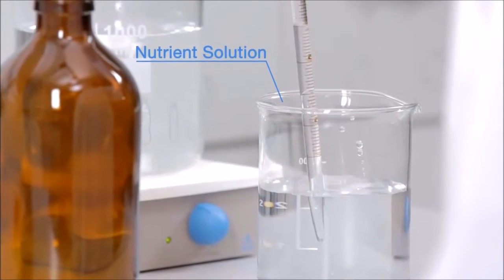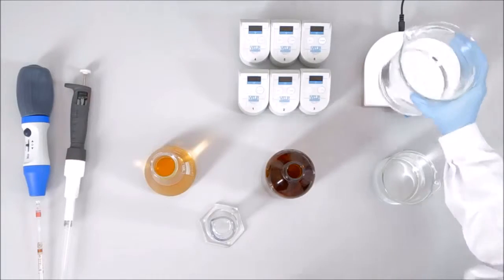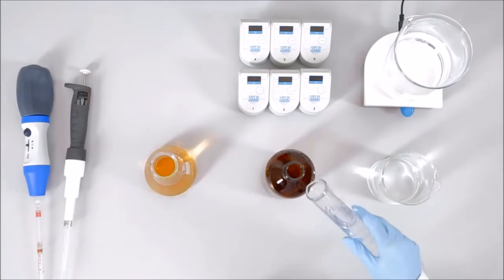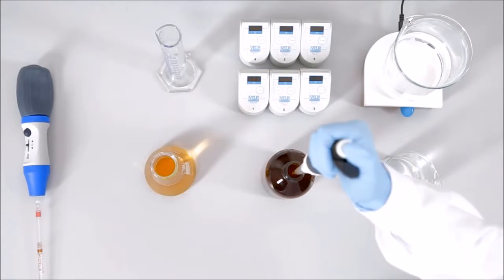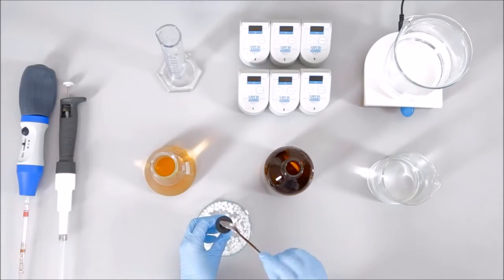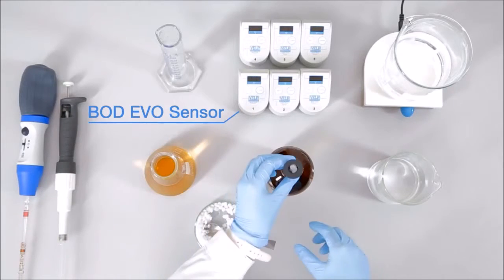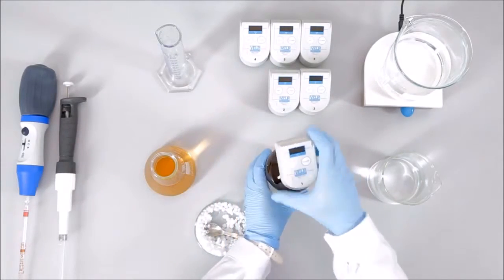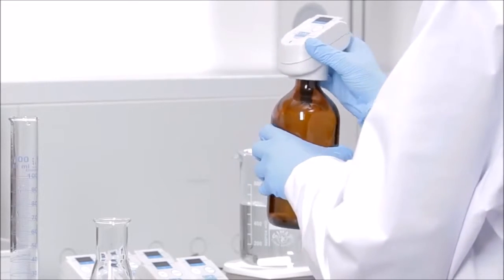The sample may require some pre-treatment activities, such as homogenization, pH adjustment, dilution, nutrient addition and seeding before being transferred to a dark glass bottle containing a magnetic stirring bar. Manufactured using the most modern and advanced construction techniques, the BOD Evo Sensor fits directly on the neck of the bottle after having inserted a dedicated CO2 absorber in a rubber sleeve.